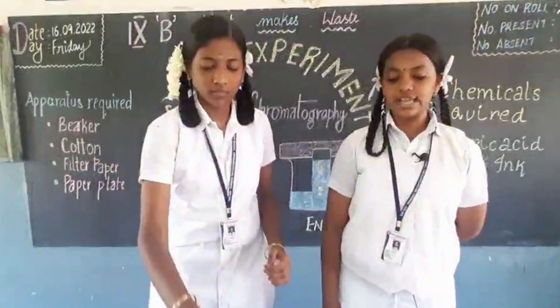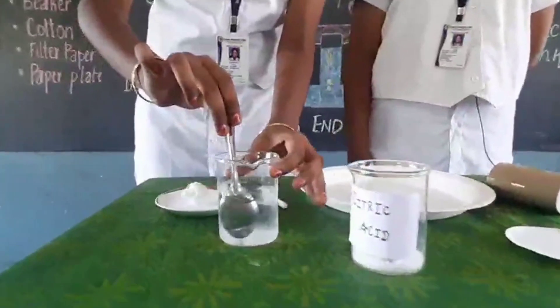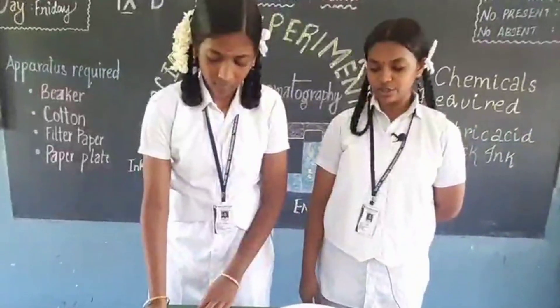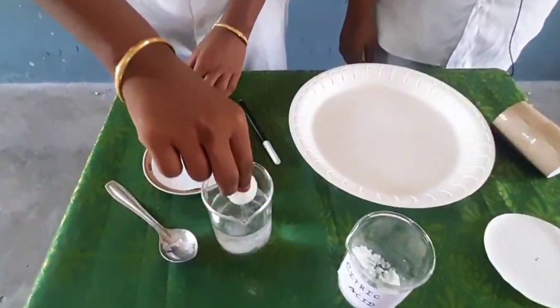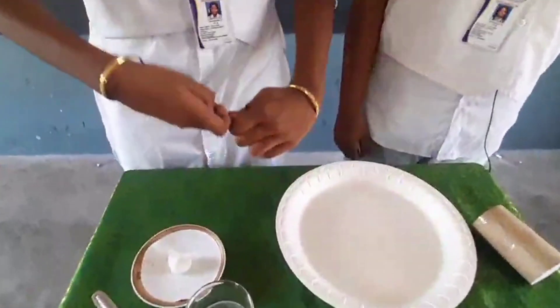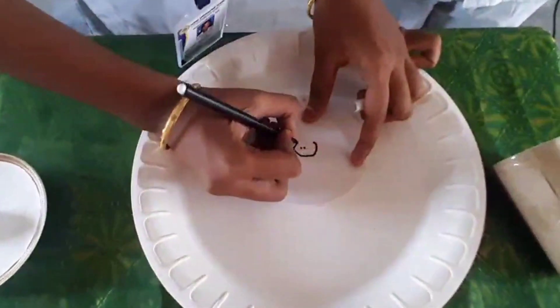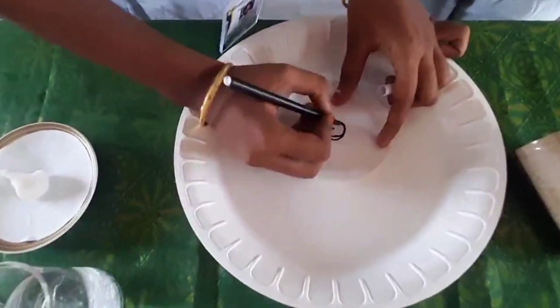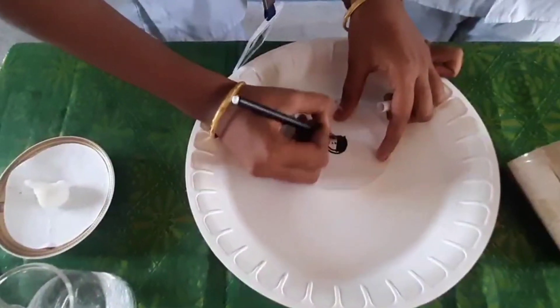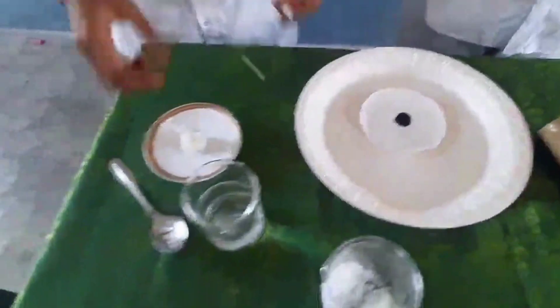Procedure: Take half a glass of water and dissolve some citric acid in it. Take a cotton ball and dip it in the solution. Now draw a small circle on the filter paper, then put the wet cotton ball on the small circle.